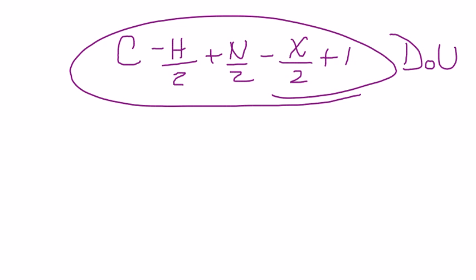And if the molecular formula of an ion is known, then we can use the DOU to determine whether the species that you will get for the molecular ion will be an even or an odd electron species. If your molecular ion is going to be an odd electron ion, then the DOU comes out to be a whole number. On the other hand, if it is an even electron ion, then it is going to end in a half, like a 5.5 type of thing.